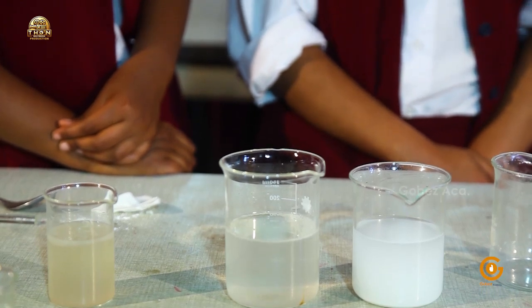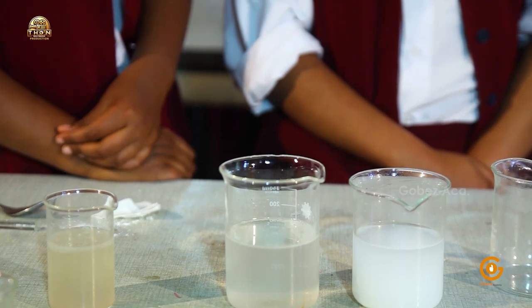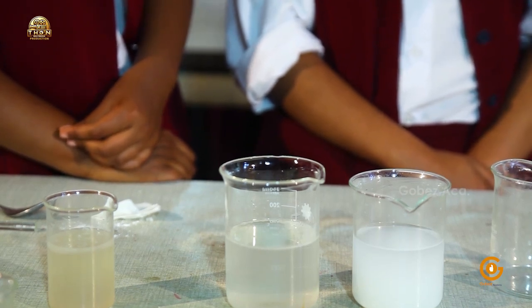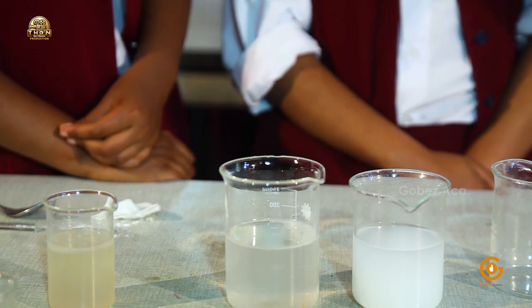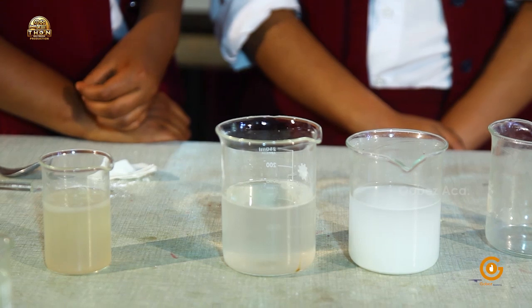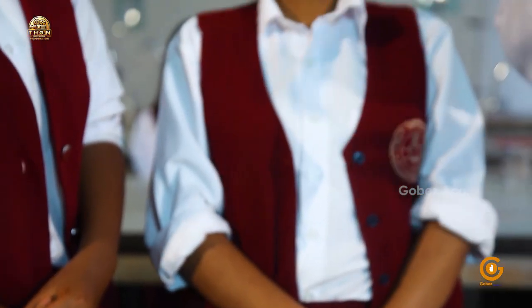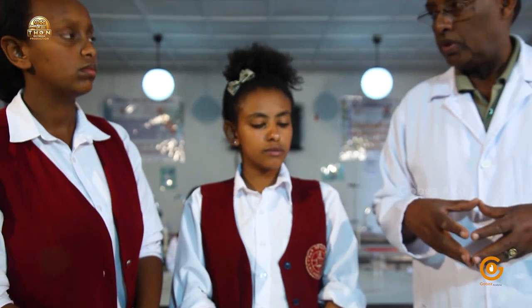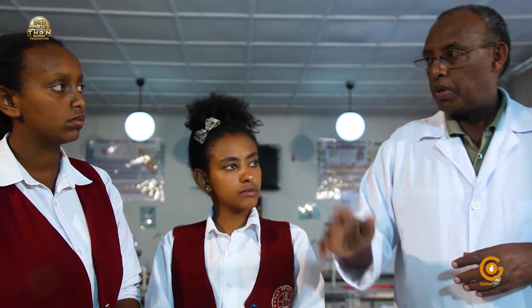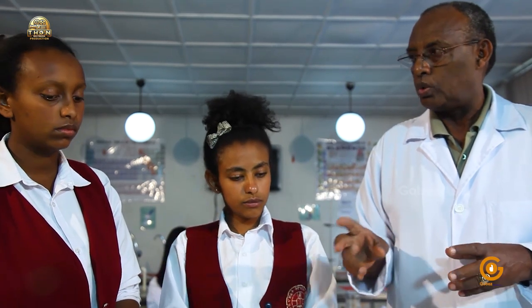So to wind up what we did today, we have seen factors like surface area, agitation or stirring, temperature, and nature of the substance affecting the solubility of a substance in a given solvent. What was common in all experiments today was the solvent. The solvent did not change.